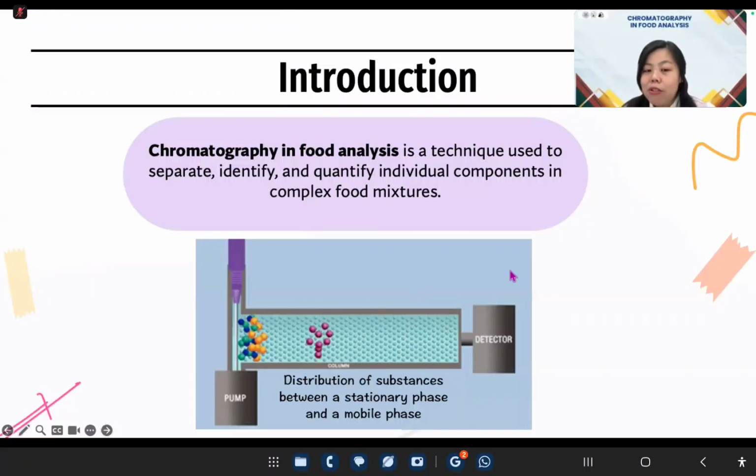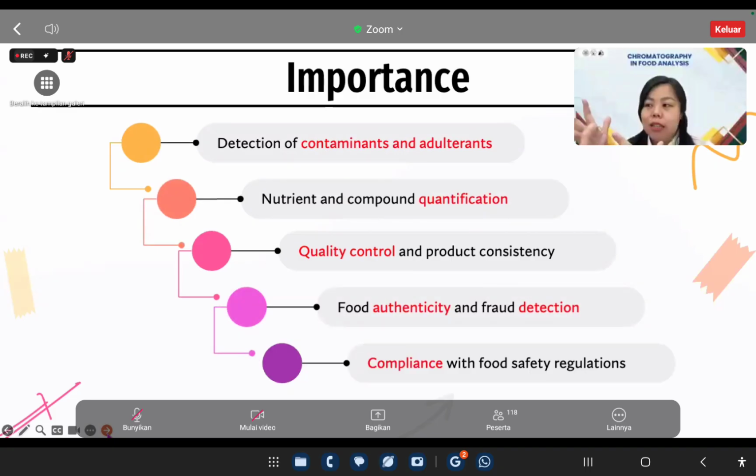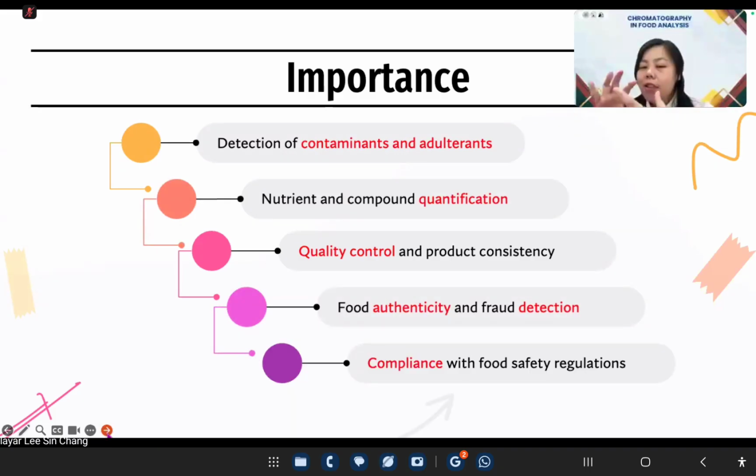So this chromatogram will show you the result of the compound, which you can quantify and identify, all right? So it's very important in the industry. To be honest, as I mentioned, I provide consultation to industry companies, right? They actually use HPLC to detect any contaminants or not.